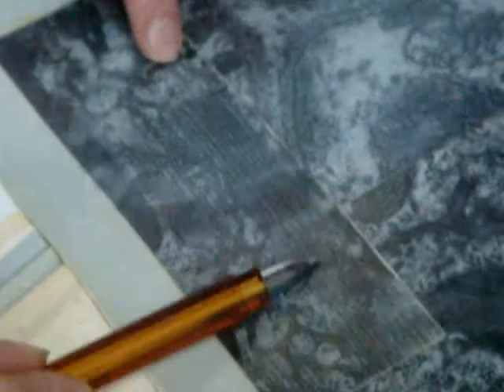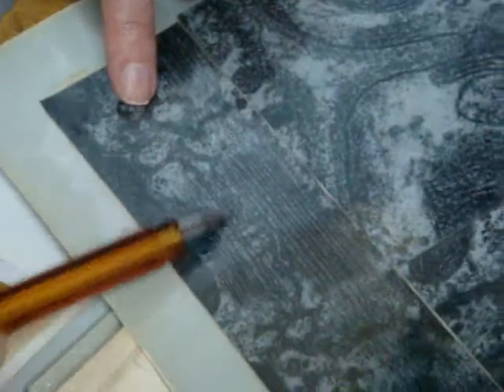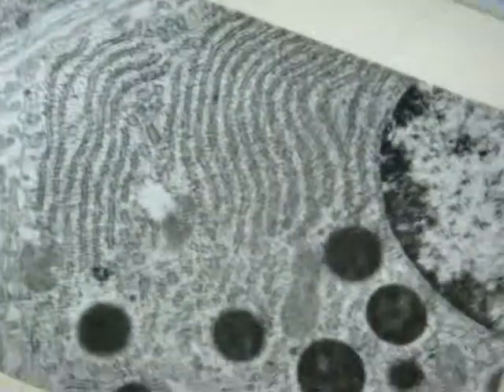And here we can see myofibrils, that line, and this system of smooth endoplasmic reticulum arranged around the myofibrils. What is the function of smooth endoplasmic reticulum? Storage of calcium. Calcium is necessary for the initiation of contraction. Yes, storage of calcium, only in muscle tissue.